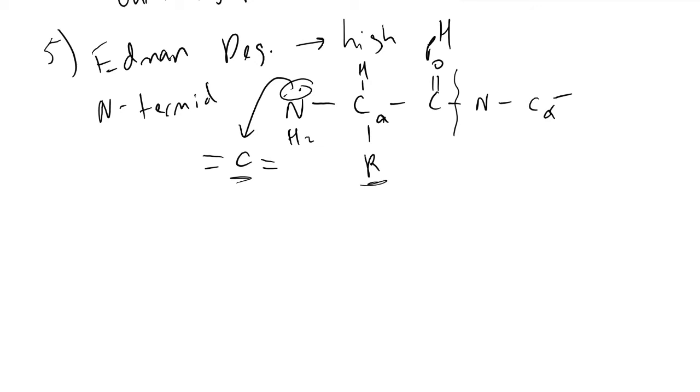That's what allows us to individually cut the N-terminus amino acid from these peptide sequences, so we don't just have a bunch of N-terminals in our solution for various random amino acids.